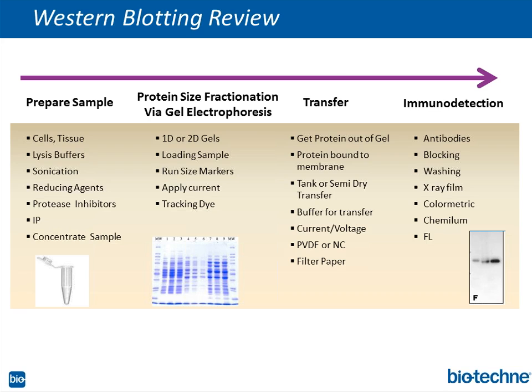And by the way, I think most people are using tank transfer and semi-dry systems. They're pretty much the workhorse. And there's PVDF and nitrocellulose, and I think the world is pretty much split. As I had mentioned earlier, if you're using PVDF and getting great results, then you stick with it. If you're using nitrocellulose, then you stick with it. As we go through the talk, I'm going to point out some differences and some advantages and disadvantages.